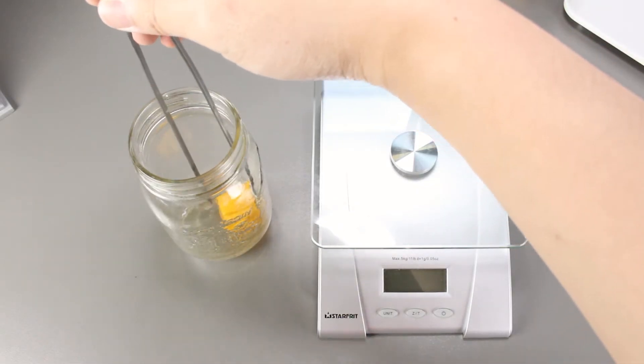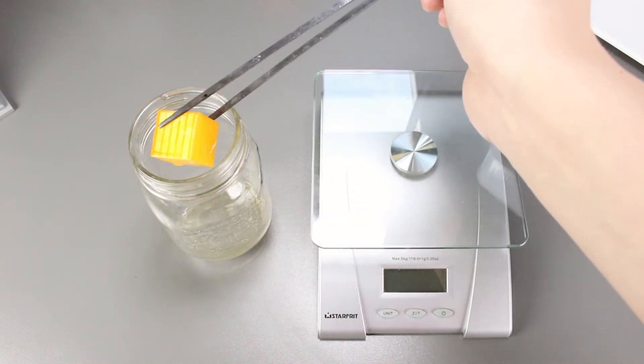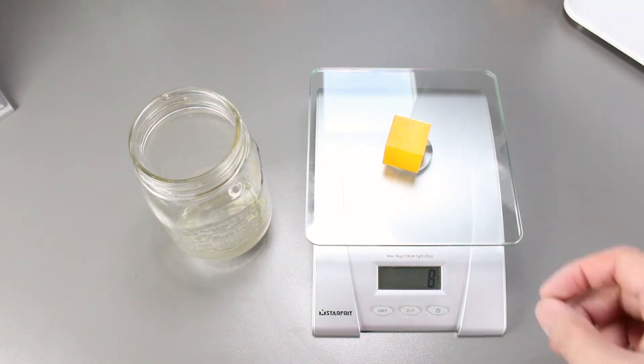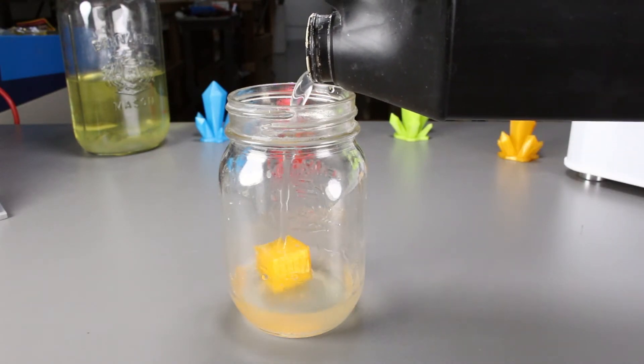Let's wash it off again and then weigh it. It's still 8 grams. Now we will put it back into the jar and add a new batch of bacteria and then wait another week.